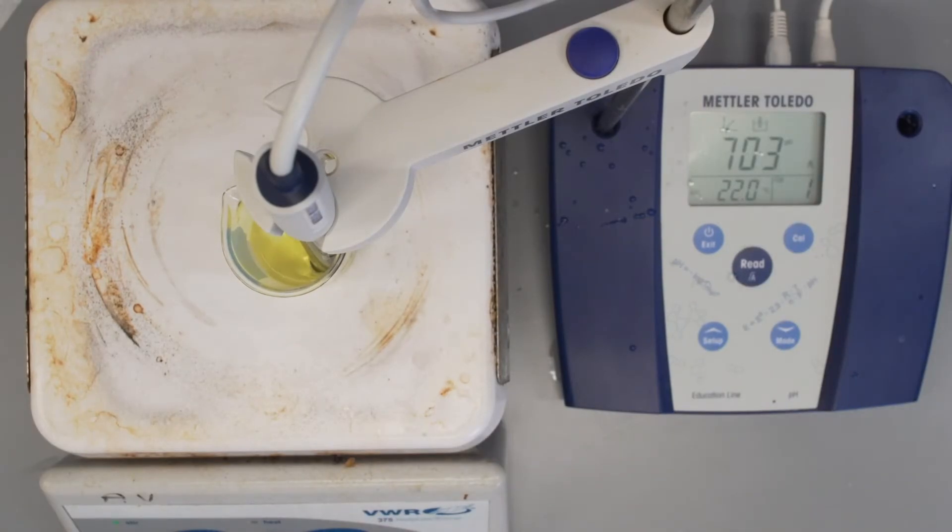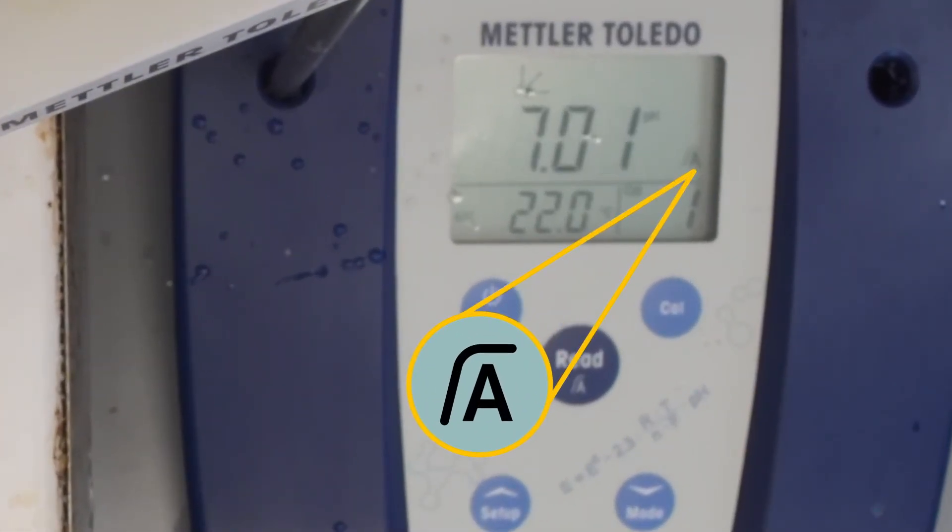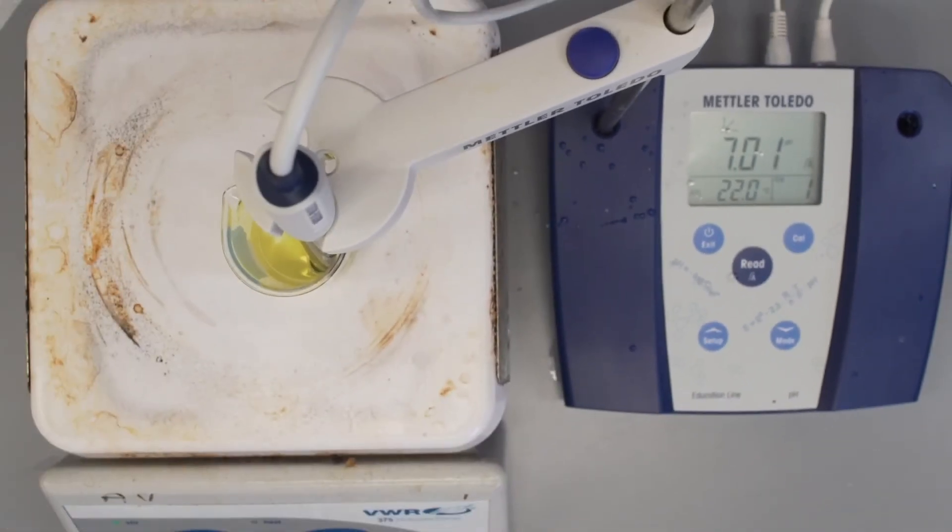Different pH meters will indicate this in different ways. In our case, a line will appear over the A at the bottom right-hand corner of the readout screen. The A just stands for automatic, which means that the meter stops readings automatically when it detects that the pH has stabilized.